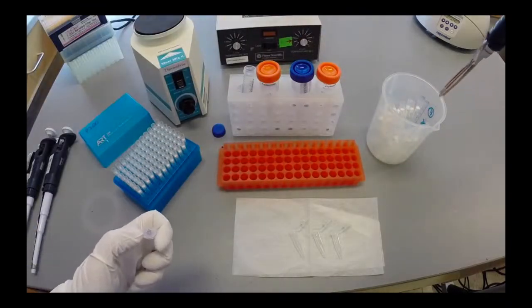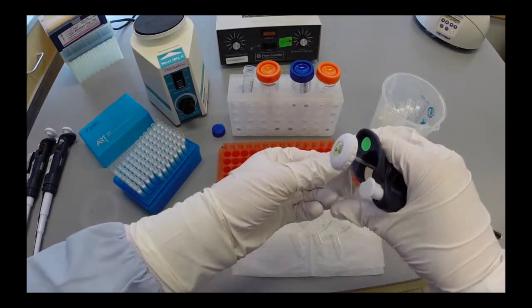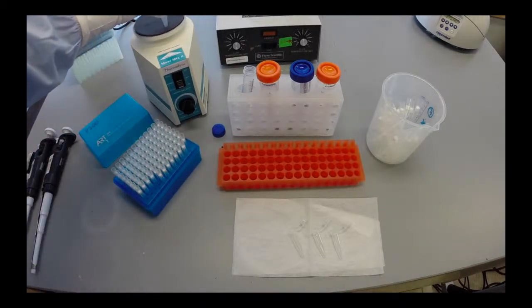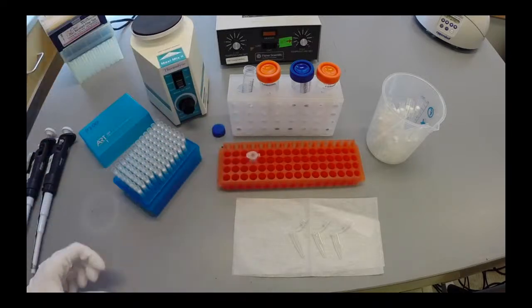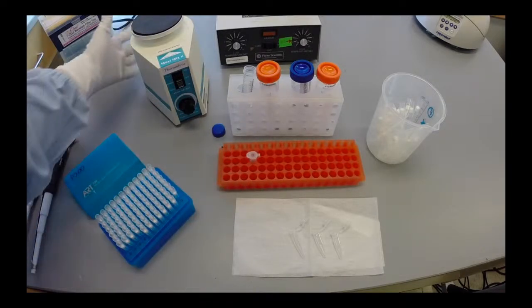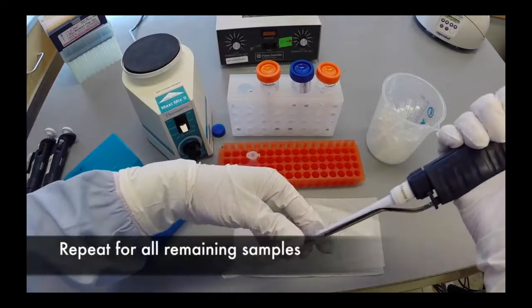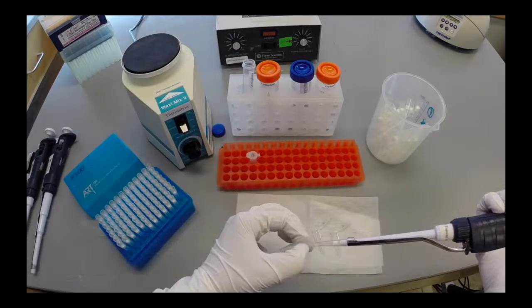Cap the tube and mix by vortexing for a few minutes. Visually inspect the tube to ensure that the pellet has disappeared or has gone back into solution. If it has not, then continue to vortex or allow the tube to sit at room temperature before proceeding to subsequent steps. Repeat this for all remaining samples.